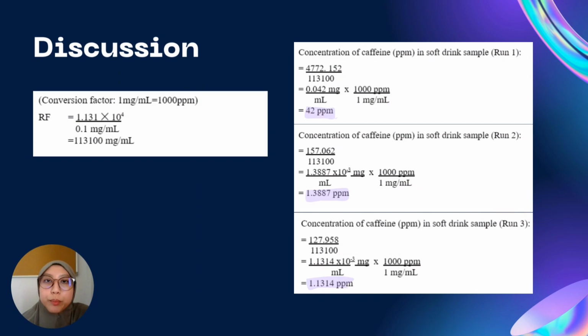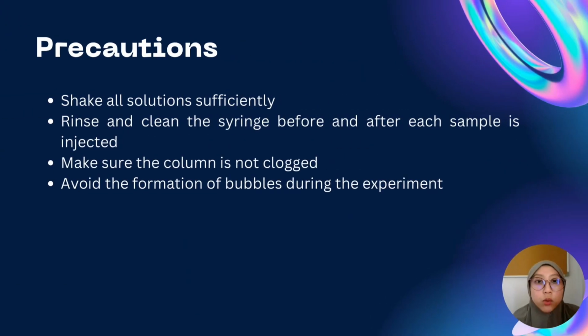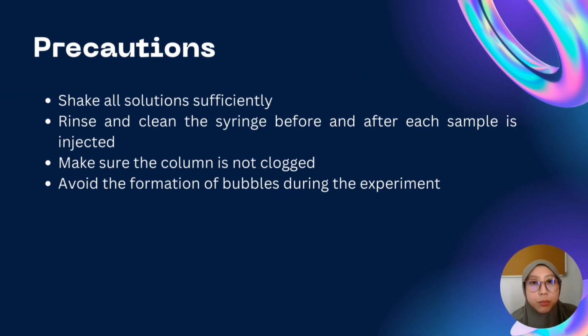By using the obtained response factor, which is 113,100 mg/ml, we were able to find the concentration of caffeine in each sample, which are 42 ppm, 1.3887 ppm, and 1.1314 ppm respectively. Throughout the whole experiment, we need to take precautionary steps to avoid errors.